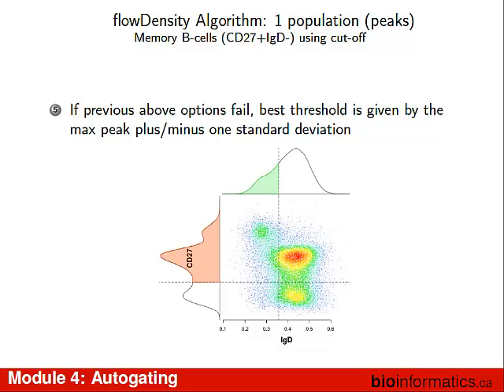I will go and do a sort, and I'll take down 7 or 8 tubes. One of them is a sample, and the others are all FMO controls. Having said that, we always do that for solids. For the cell surface markers, most of the time the distance is such that it's not a problem. It's not commercially feasible. I can't justify it.